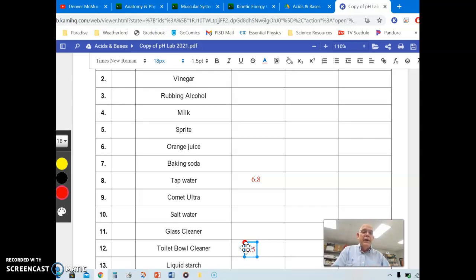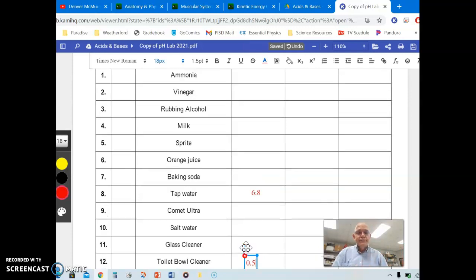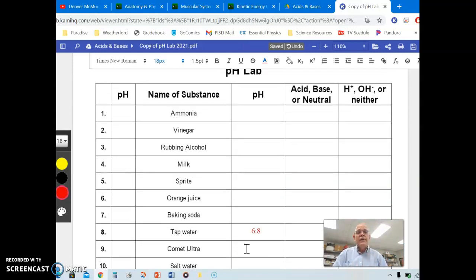Then we would put whether it is an acid or base, and whether it gives off hydrogen ions, OH negative ions, or neither. Now, keep in mind, in general, cleaning supplies tend to be bases because bases do not attack metals, and since you have fixtures and pipes and faucets that are metal, a lot of times we don't use acids as cleaners. However, toilet bowls are made out of ceramic and they drain into PVC pipes, so we can sometimes use those. All right, now here we are for the last one that we're going to do here.